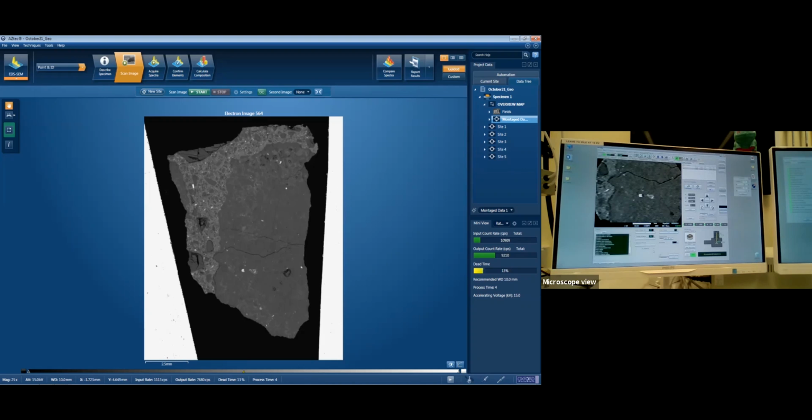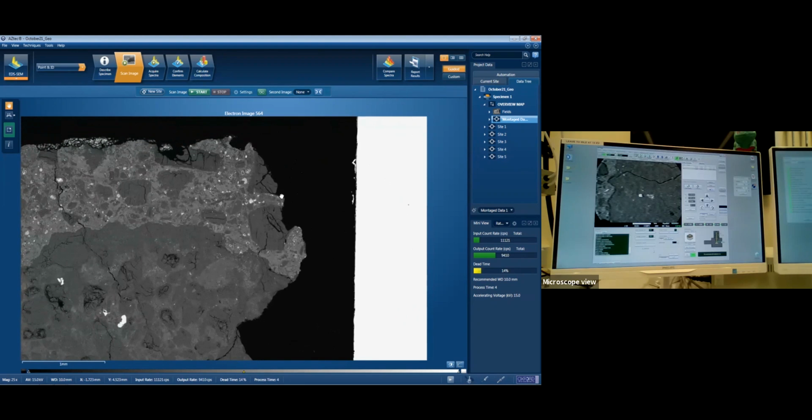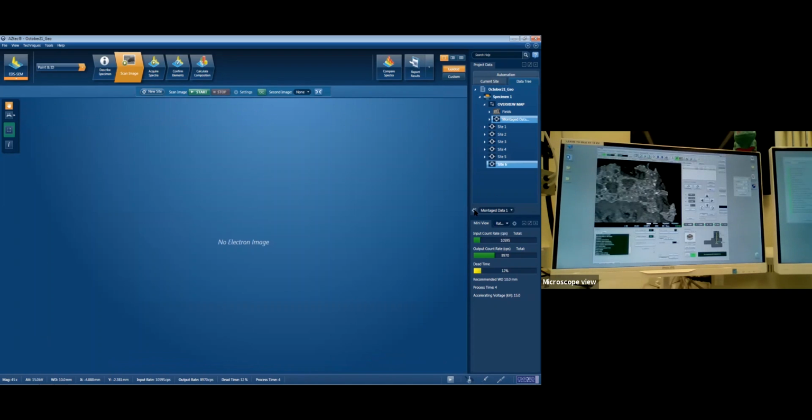What's going on in the top right? Looks like the light grey bit is cutting through the darker bits. I would say you are completely right. This bit up here. Yes. Lorelei is just going to drive all the way across. Make a new site. We'll just let everything come into focus.